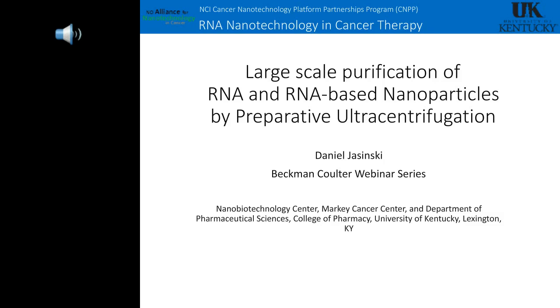Daniel's research interests focus on the construction and manipulation of nanoparticles composed mainly of RNA, publishing in several high-impact journals. The clinical translation of RNA nanotechnology is hindered by the amounts of purified material needed for treatment. Confronted with this problem, Daniel spent time developing approaches for the large-scale production and purification of RNA nanoparticles, especially ultracentrifugation, which acted to retain the integrity and function of the nanostructures.